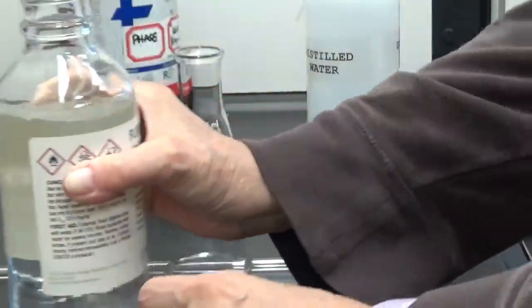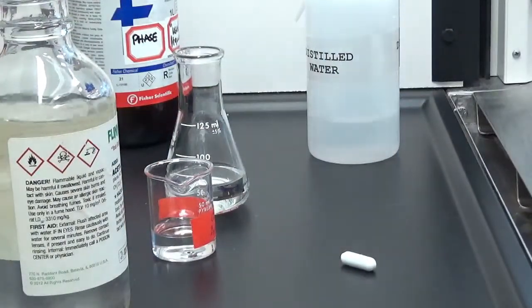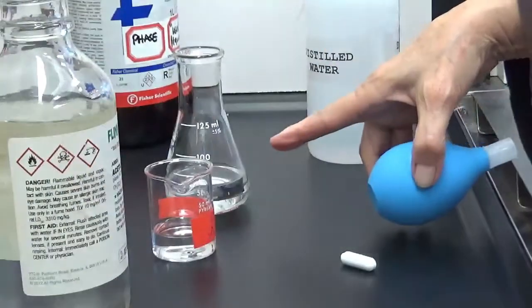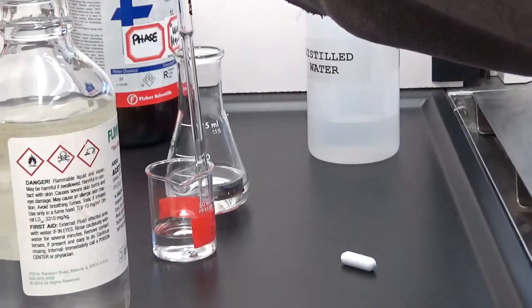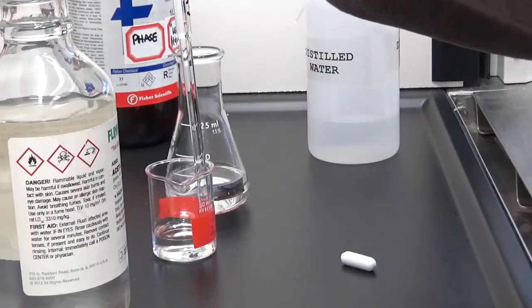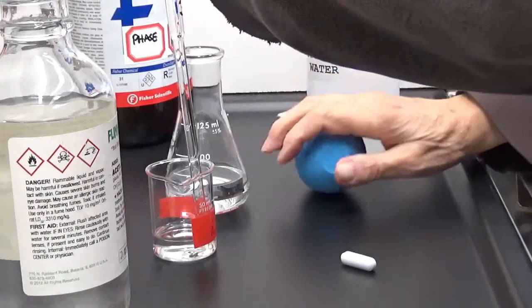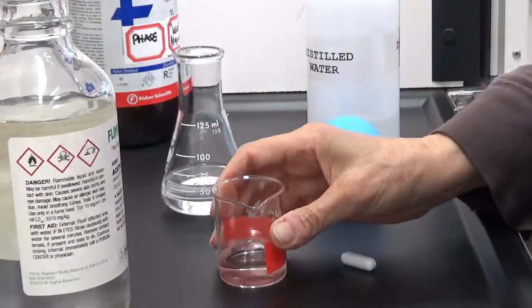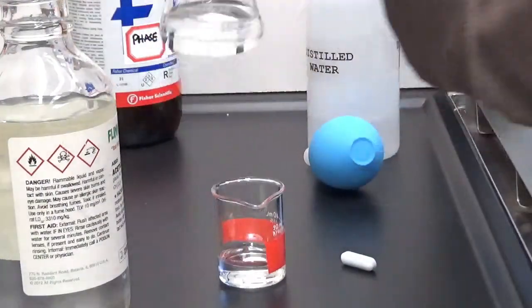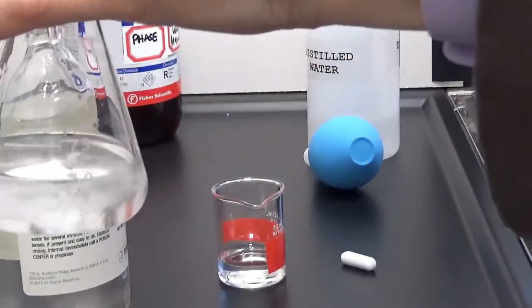And I'm going to pipette 3 milliliters of that glacial acetic acid into this flask with the butanol and water. Okay, so let me do that. Cloudy. I'm going to mix it up.